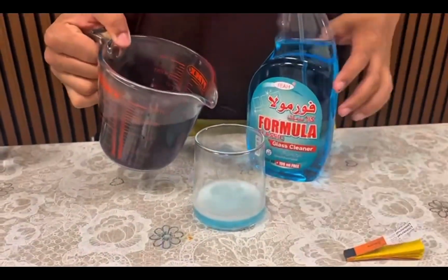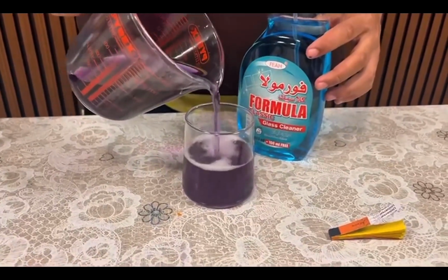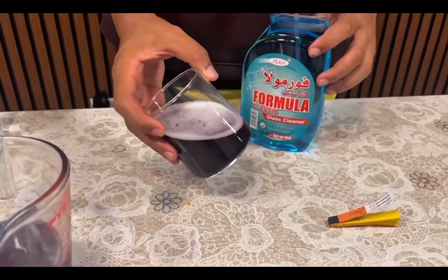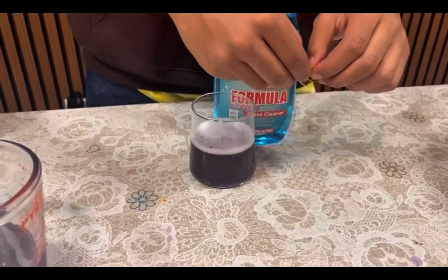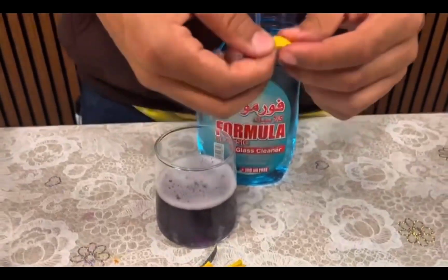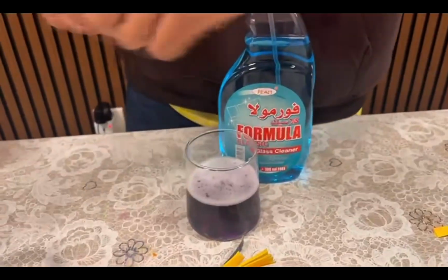It has a bluish color initially, but when mixed with cabbage juice, ooh, that's a reddish color. That's nice. Okay. Very dark purple. I think it's closer to blue a bit. This is a strong base. Its pH is probably high, around 7 to 8 expected, or just 8 maybe.